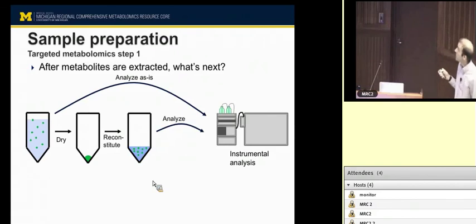Okay, so sample preparation. The goal of sample preparation is to make a biological sample ready for analysis. And so the typical steps that we will do in the lab, or that you might do if you were doing preparation yourself, would be to add some sort of an extraction solvent. Extraction solvents in metabolomics are a little bit different from most other macromolecule sort of studies. Often it will contain or be primarily composed of an organic solvent. Methanol, acetonitrile, chloroform are typical solvents that might be used.